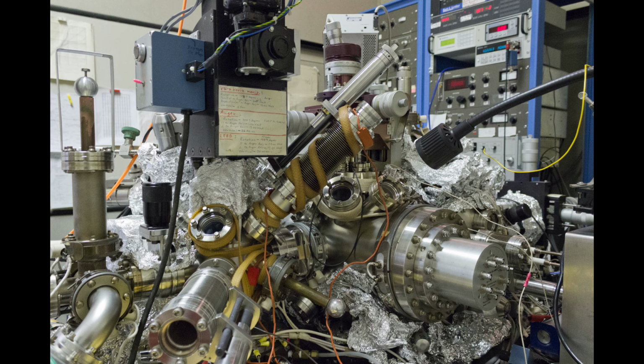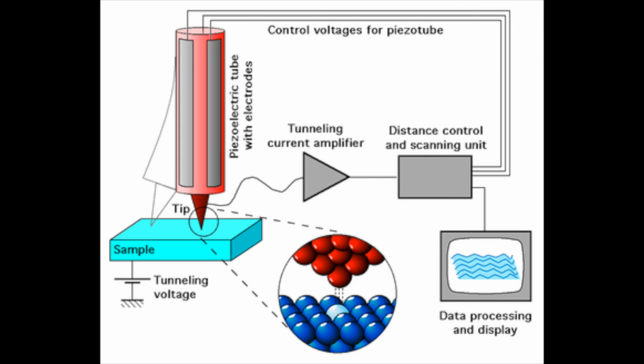The scanning tunneling microscope, or STM, images surfaces at a 0.1 nanometer resolution. With this tiny resolution, individual atoms within materials are routinely imaged and manipulated. The STM can be used practically anywhere, in ultra-high vacuum, air, water, and various other liquid or gas ambiences, all while at temperatures ranging from near absolute zero to over 1,000 degrees Celsius.